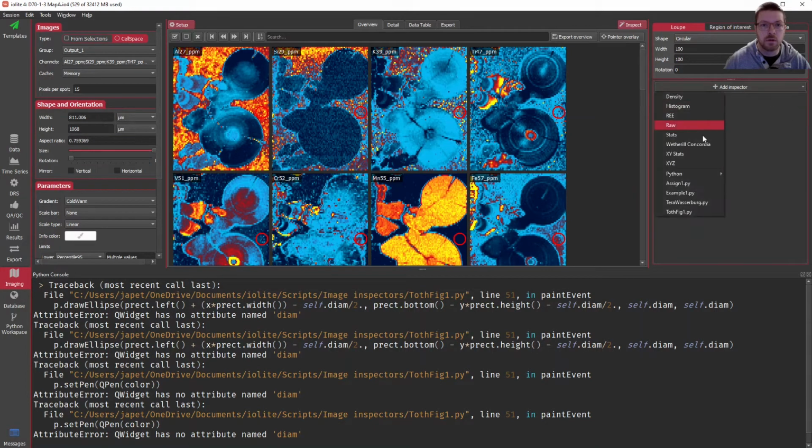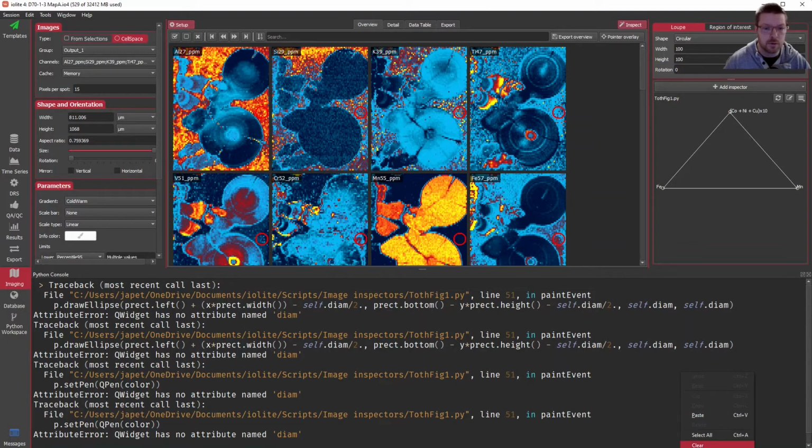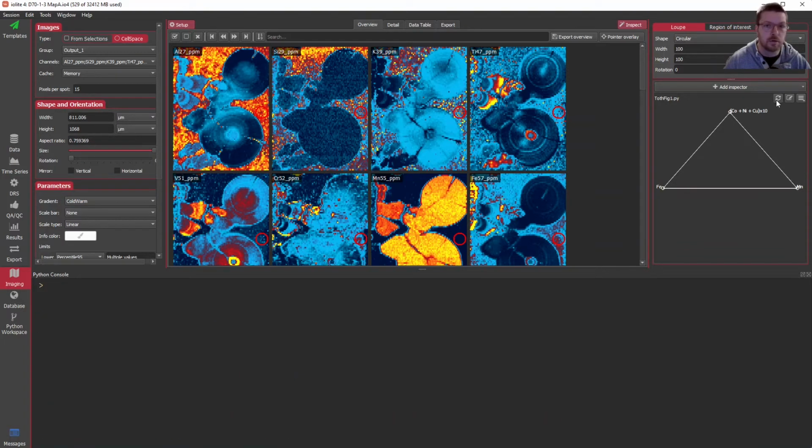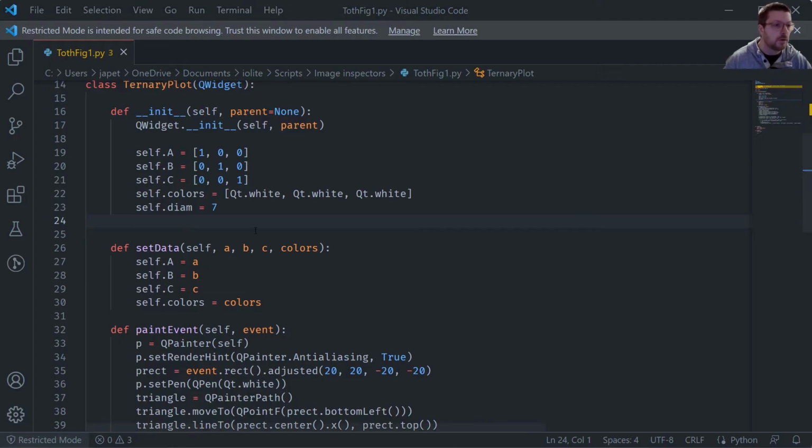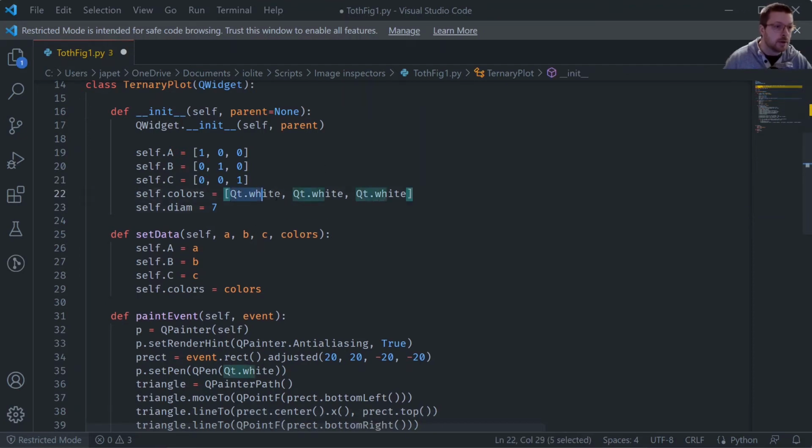Okay, right, so now I've got circular data points at each of the vertices, so I think we're just about all set here. Let me just clear and make sure I'm not getting any errors. Yeah, there are no errors there. Perfect. So we're on our way, and we can reset this now because we know it's plotting appropriately.